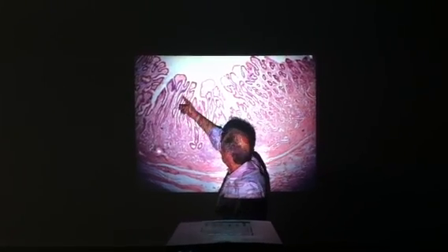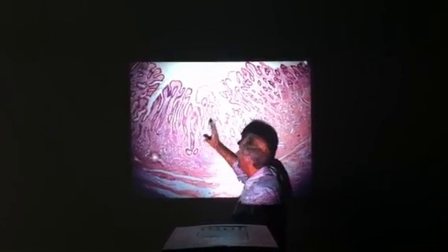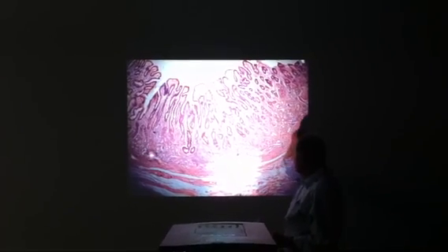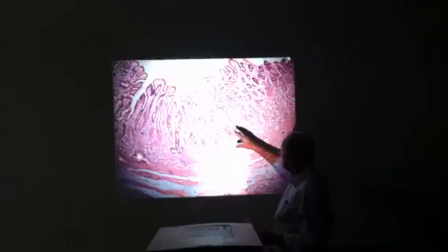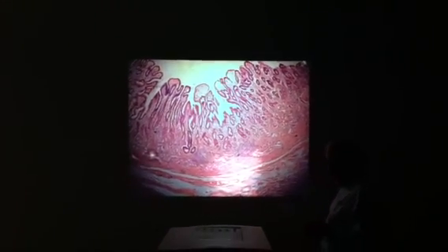Down in there, those are gastric pits. They're lined with simple columnar epithelium, which you can't really see at that power. But this is all what's called a mucosa out here. I don't really go over mucosa, submucosa, and all that stuff, except with the colon.